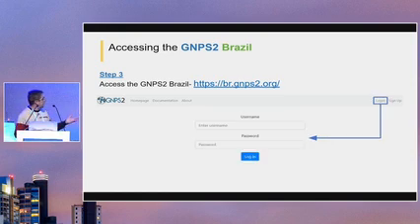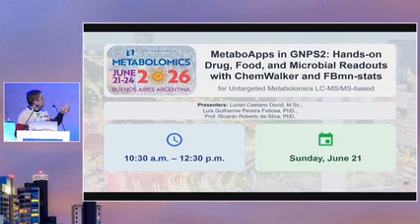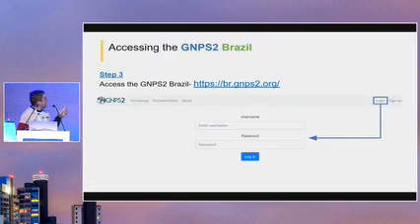So that's basically it. After you do this connection, this password management tool, you'll be able to access the server in Brazil. We now have only one workflow of feature-based molecular networking, but if you are kind enough to adopt this server, we will add more workflows.